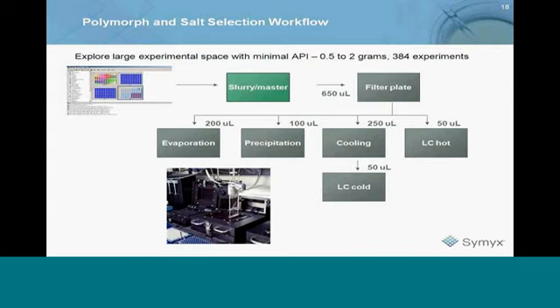So the way we do those in our lab is we prepare the studies like I talked about. Samples are generated. Then those samples are stored in various types of humidity chambers that are set at different types of humidities for different lengths of time. You can log them into the software, so you can log them in and bring them out. You can record exactly how long samples have been staying at each of the different environmental conditions. And then when you go back to the X-ray, we would end up having a series of either X-ray analysis or Raman analysis. And so you can look at how the X-ray analysis changes over time, and they'll track that as a function of time, as a function of either humidity or temperature as well.